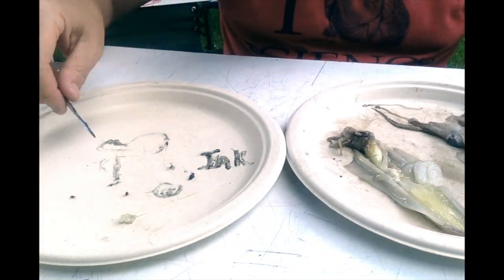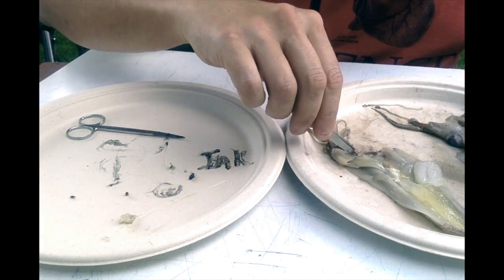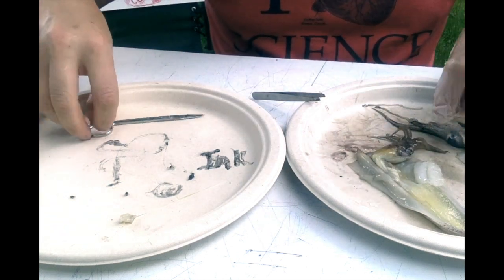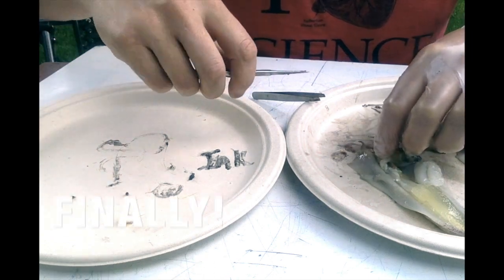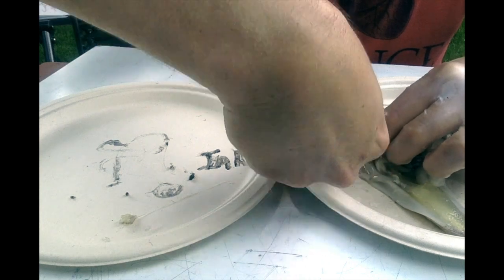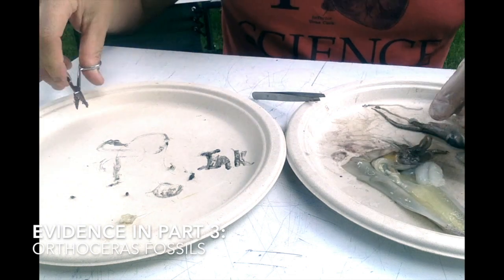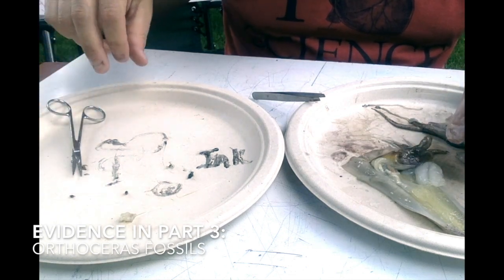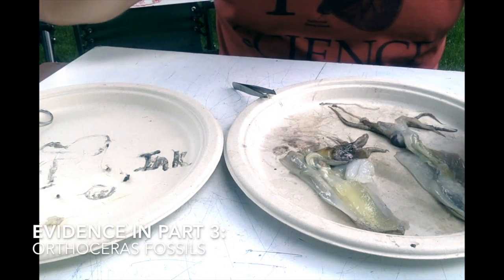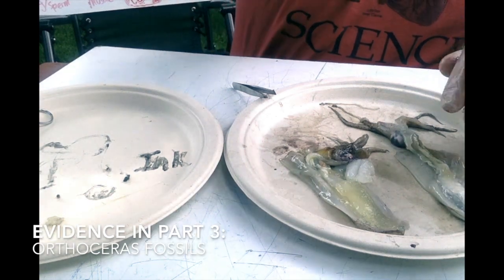All right, now we have our lens right here. So another structure, maybe something that's probably the most satisfying thing to do in this whole dissection, is the pen. And squid evolved from earlier squid and other mollusks that had shells. They lost their shells over time. And by lose their shells, squid didn't actually lose them entirely. They internalized their shells to become more fluid swimmers in the water.